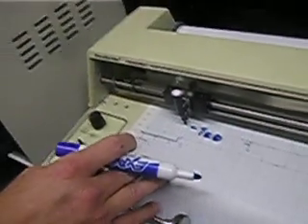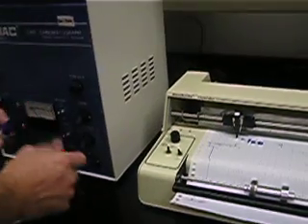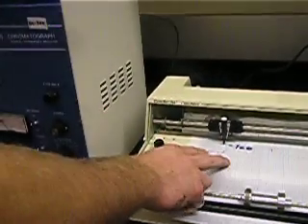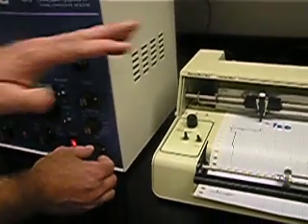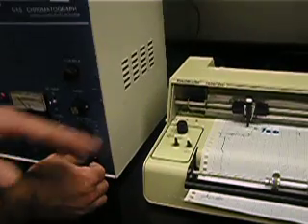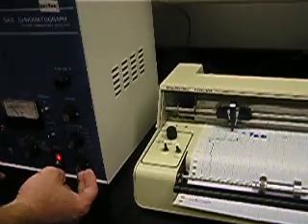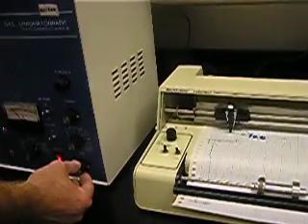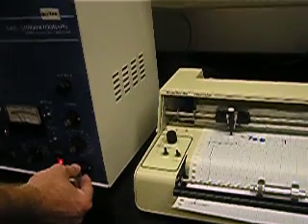I'm going to take you back to the GC so you can see both the GC and the strip chart recorder. Before you inject your sample, you've marked your T0 on the paper. You want to make sure that you have signal going to the strip chart recorder. You can see the pen is moving as I toggle the zero knob. You'd rather check and make sure you're going to get some sort of detection than just inject your sample and hope.